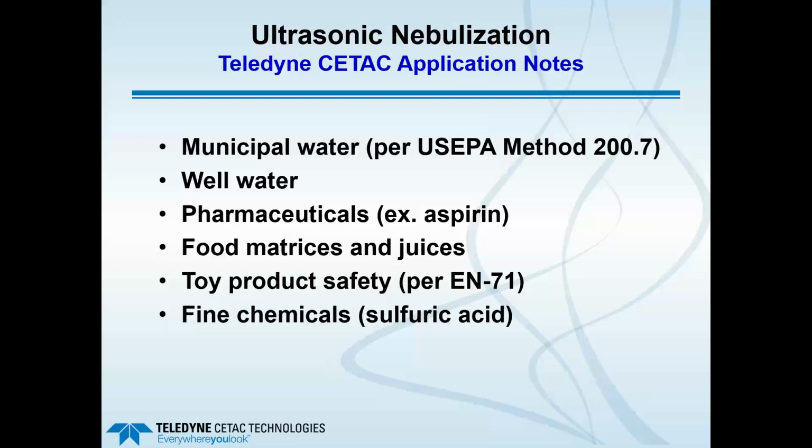That's also been done. And moving to the fine chemicals industry, it's even been used for looking at things like sulfuric acid, which are used in certain chemical processes. So a wide variety of applications where it can extend the detection range of ICP optical emission.